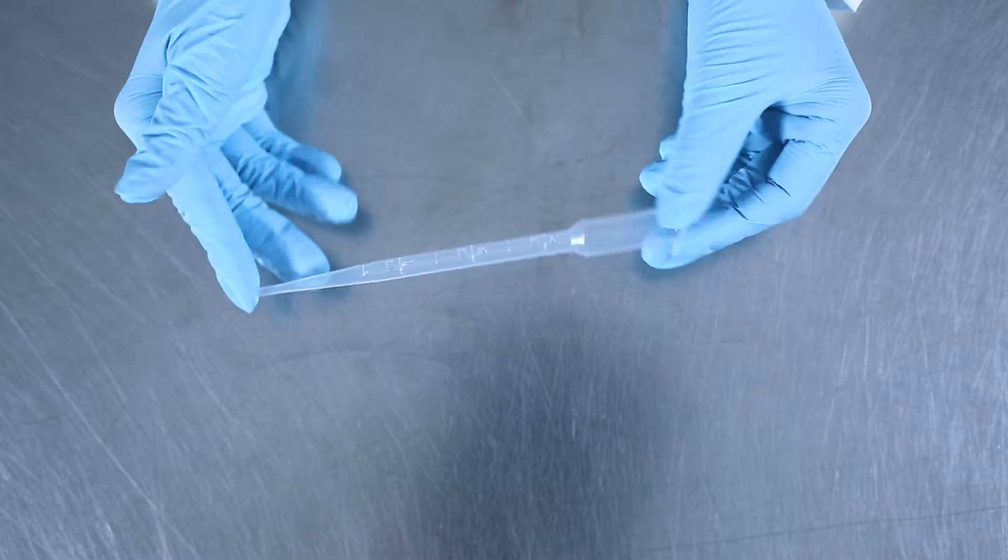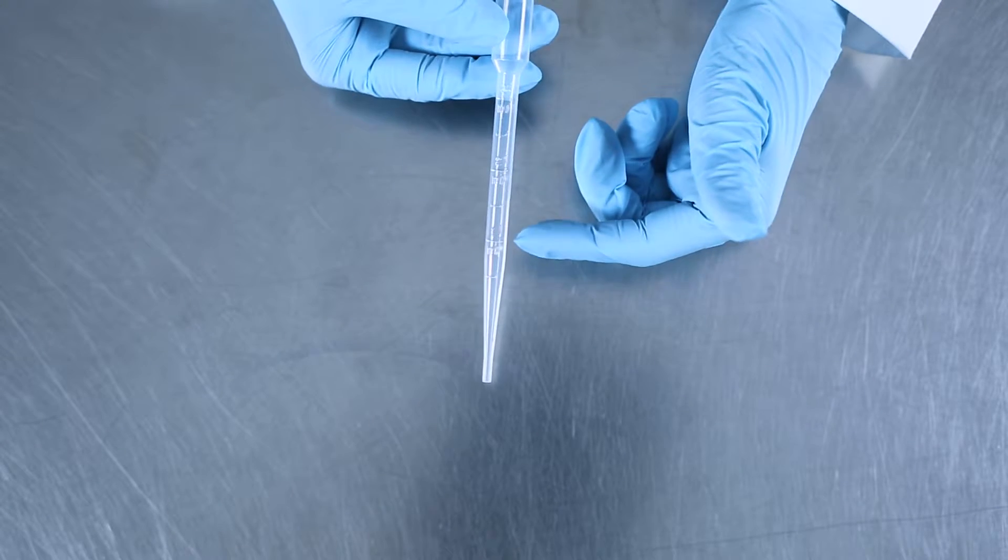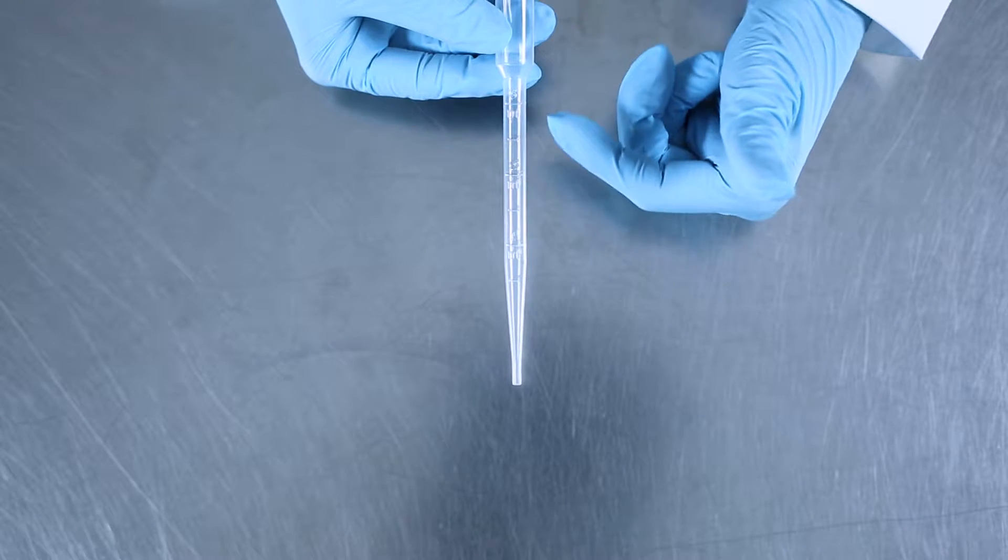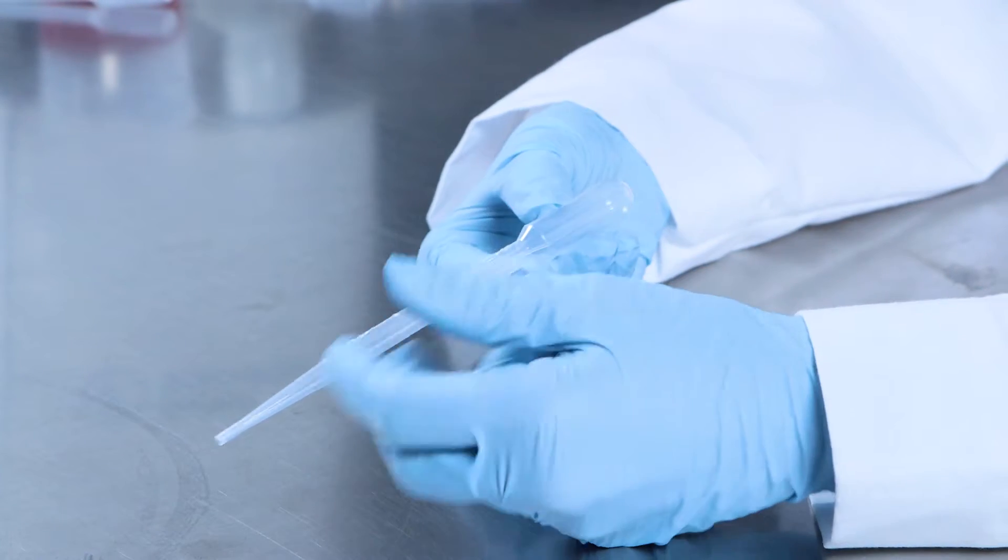The pipettes are molded in one piece and do not require assembly. Graduated transfer pipettes can draw and deliver specific liquid volumes by following the graduation marks on the stem.